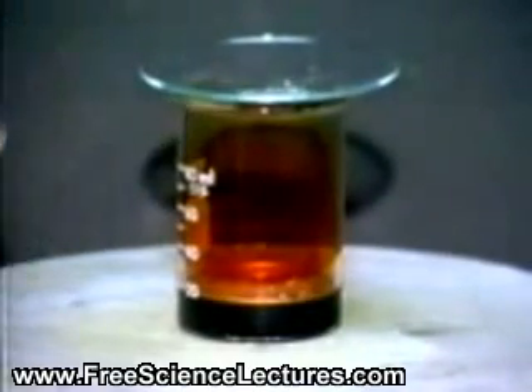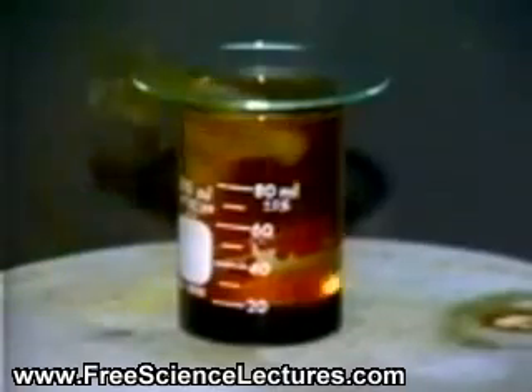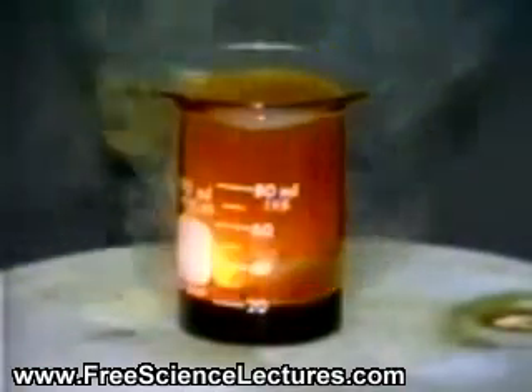The light aluminum pellets and aluminum powder float on the bromine surface. Within a few moments, they begin to react exothermically. The pellets skate around the bromine surface.